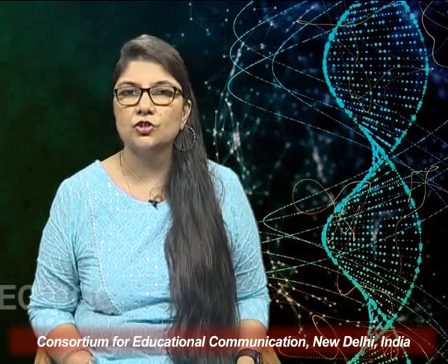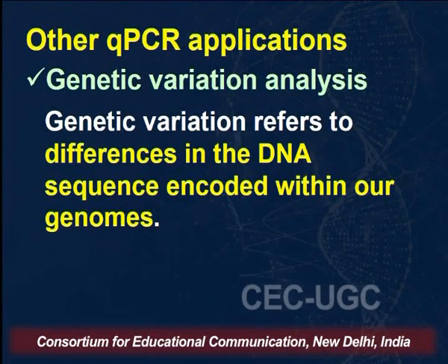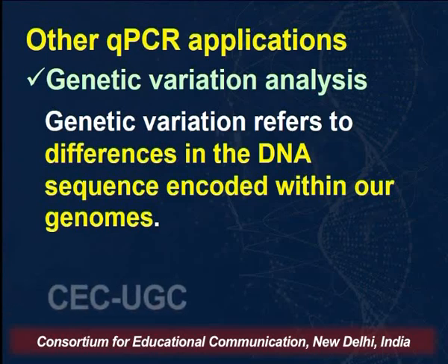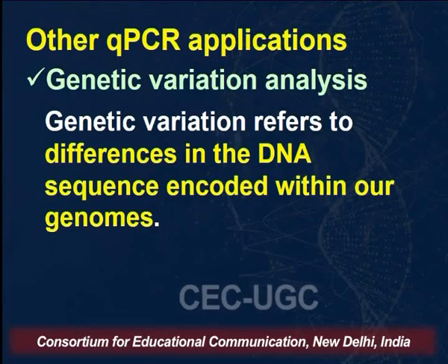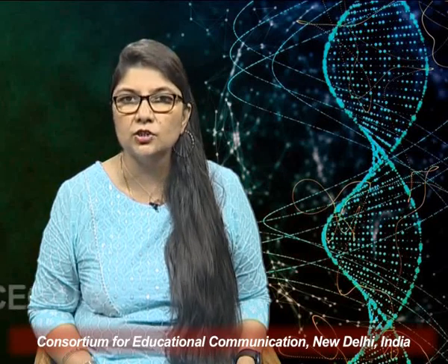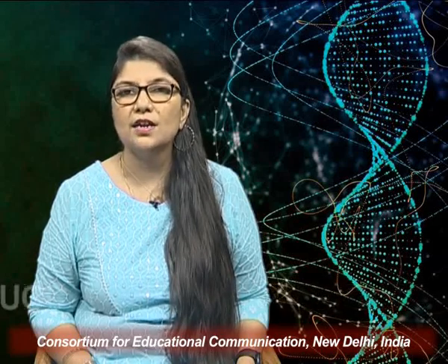Other qPCR applications involve genetic variation analysis. Now, genetic variation refers to differences in the DNA sequence encoded within our genomes. So, these differences, we know over the evolution, there is accumulation of various kinds of variations in the genomes, and therefore the genomes of individuals vary because of these variations. So we can assess these variations by qPCR as well.